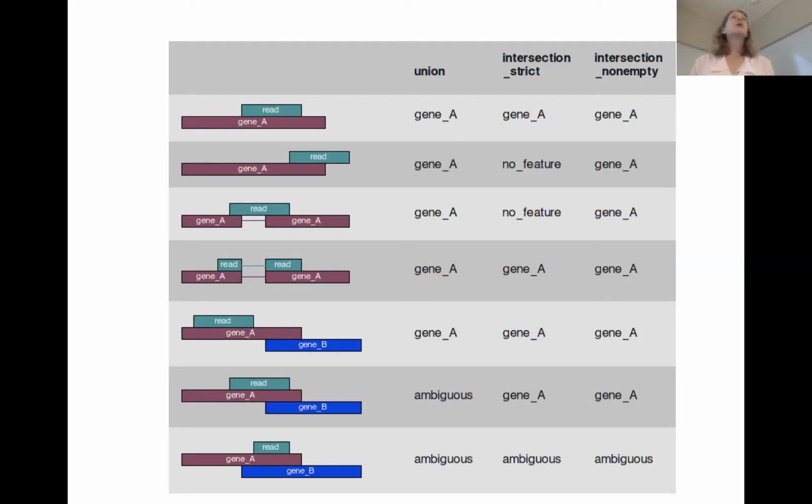Once you install it, it will actually download all of the Python libraries, and it also brings the htseq-count script with it. So you don't have to write the script from scratch. It just gets provided with the package. Yep, you're going to install the Python package, and then once you install it, you'll have the specific file that is the script. And when you run the script, Python will be able to find the package you installed and run the script. Yeah, and so that's basically how it works.